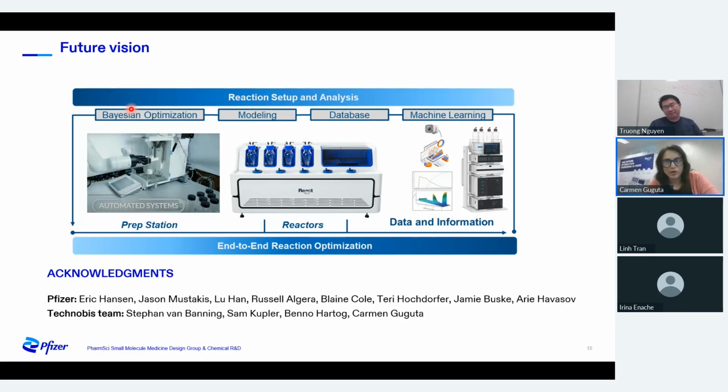Because what we are always saying, and what I remember from the design of this reactor, is that from the cap, from the moment you take the sample until the needles, you do not have valves, so in principle it should go smoothly in that place.